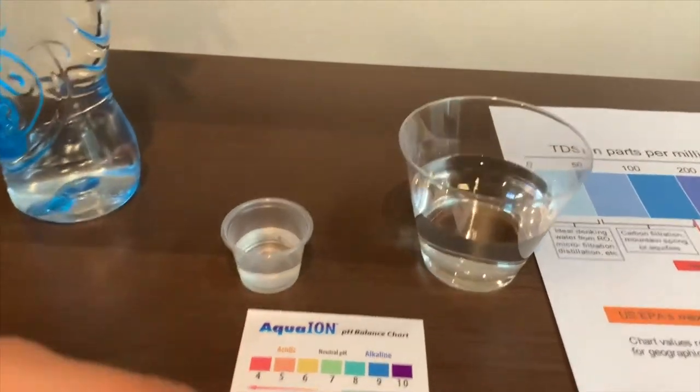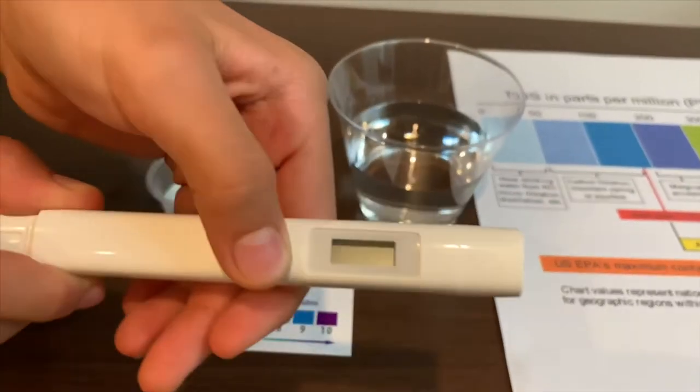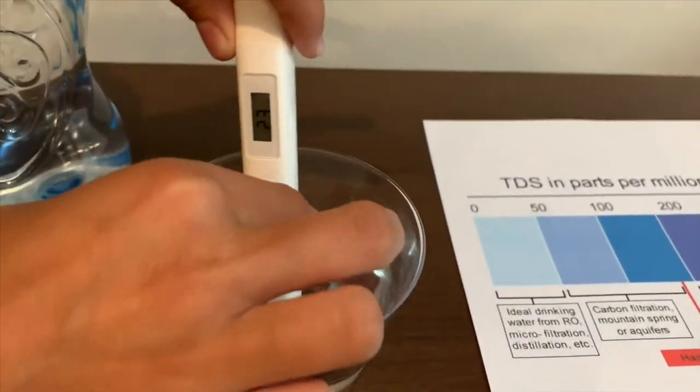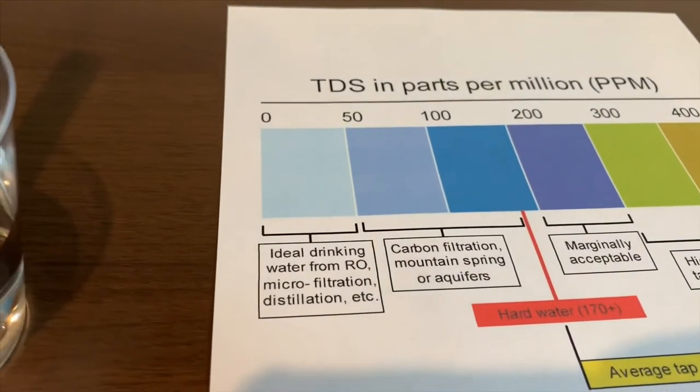Let's do the TDS testing first. Turn on the TDS tester. Make sure it's on. Put it in. The reading is 50 — that is okay.